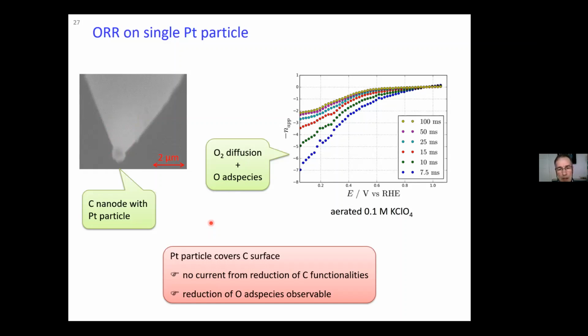So it just goes to show that when you perform these experiments at very short times, any extra contribution will be picked up, and so you must be aware of that when you perform your sample current voltammetry.